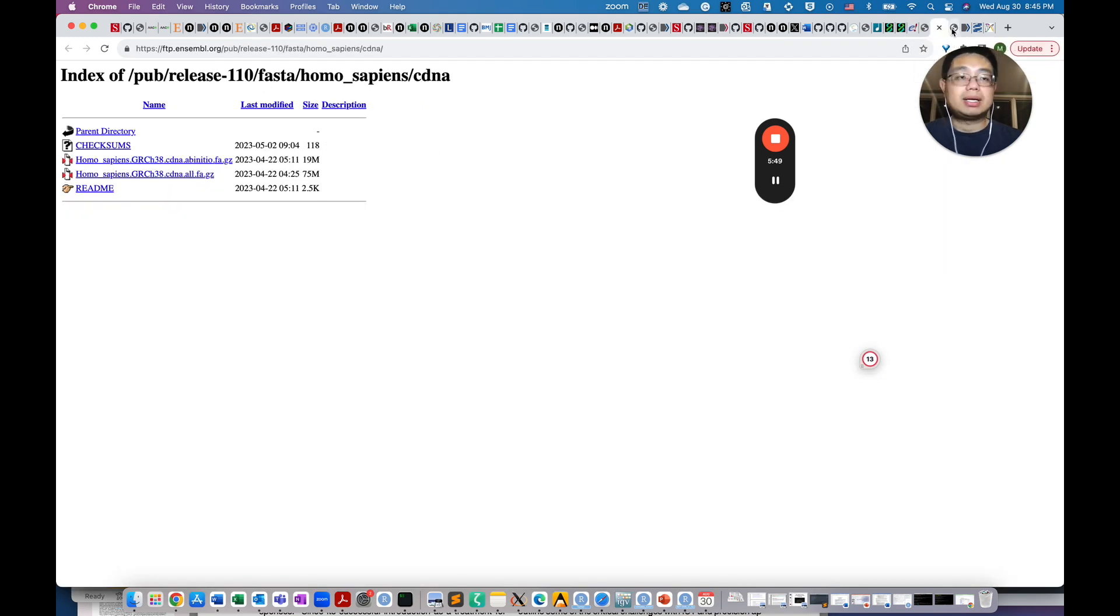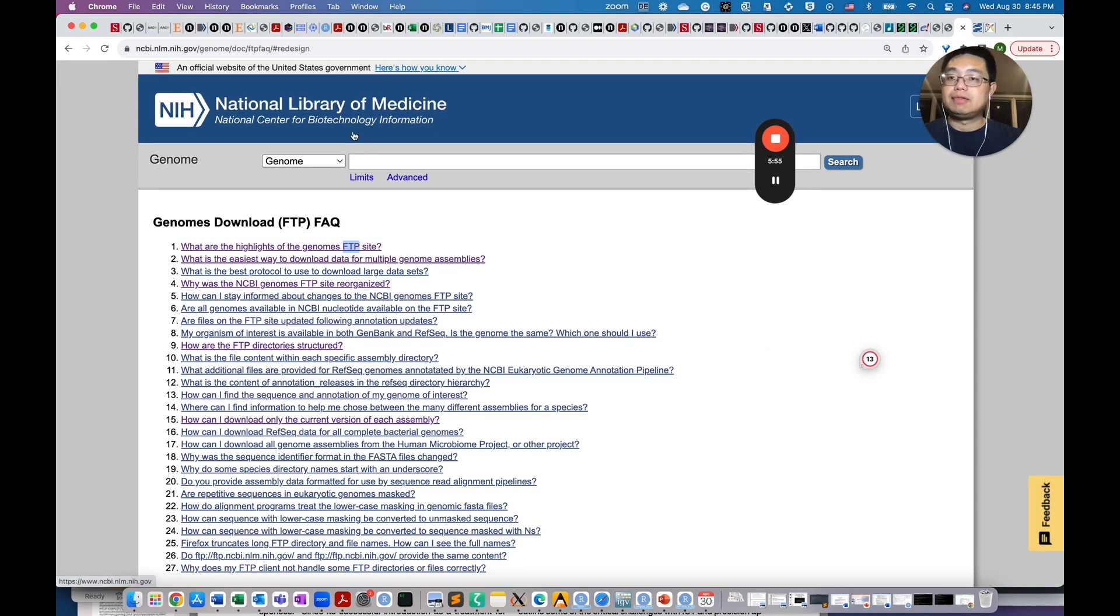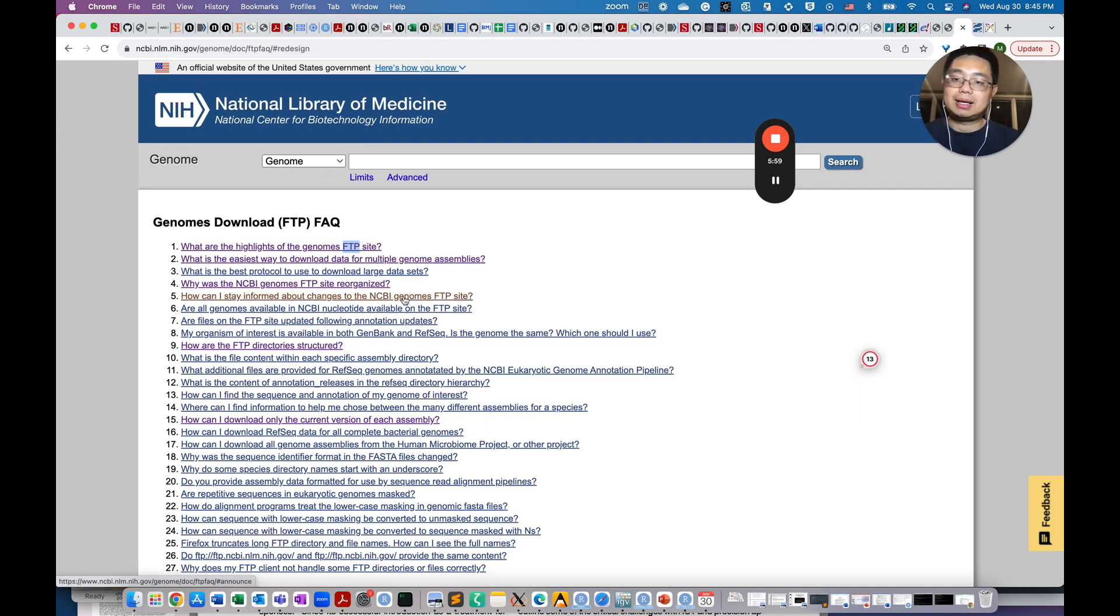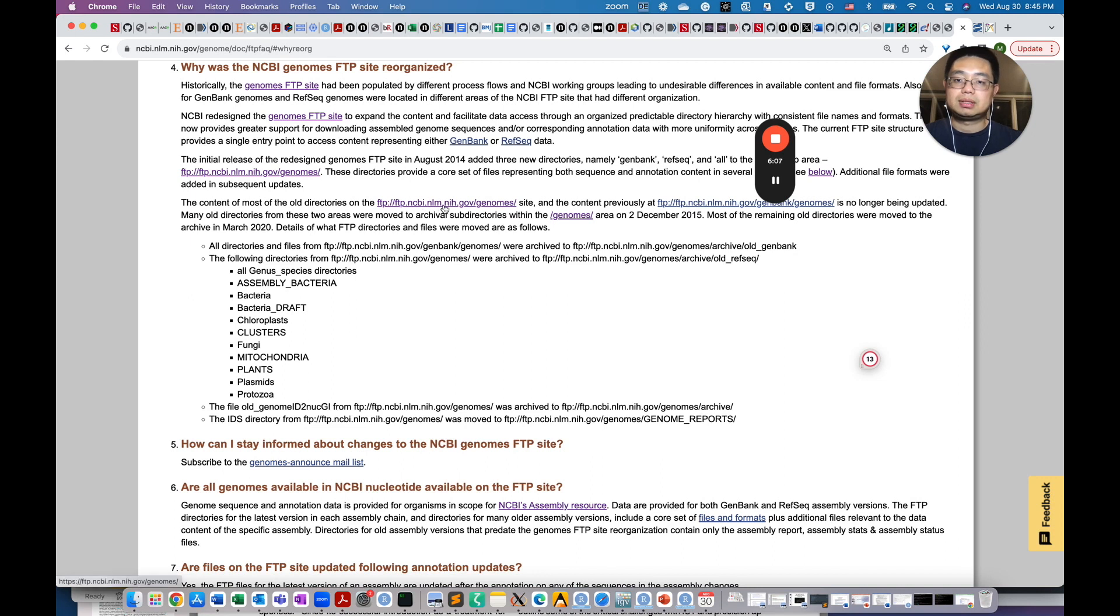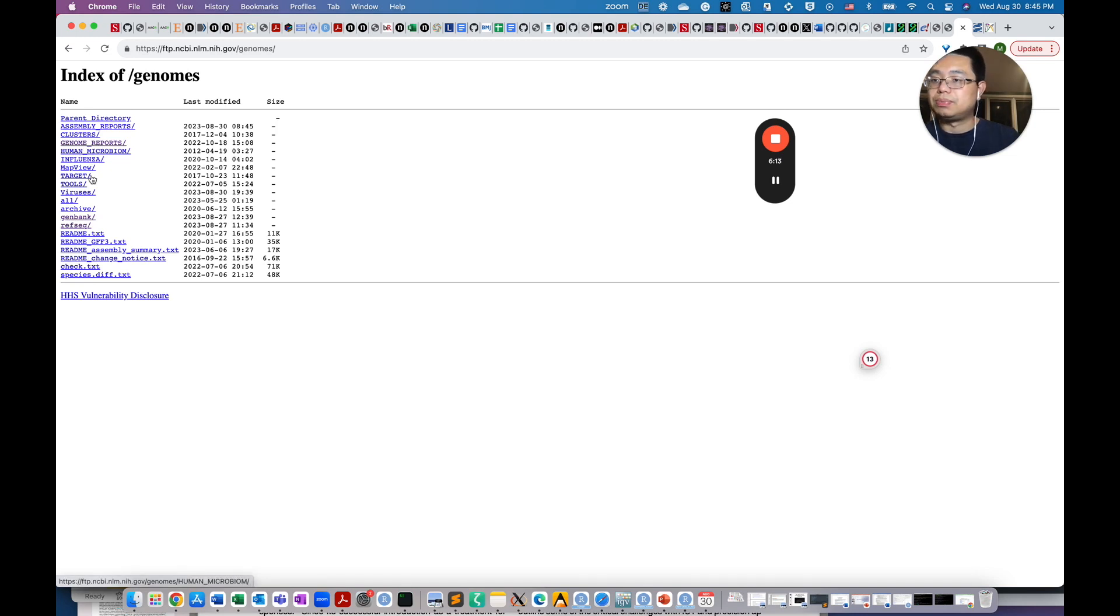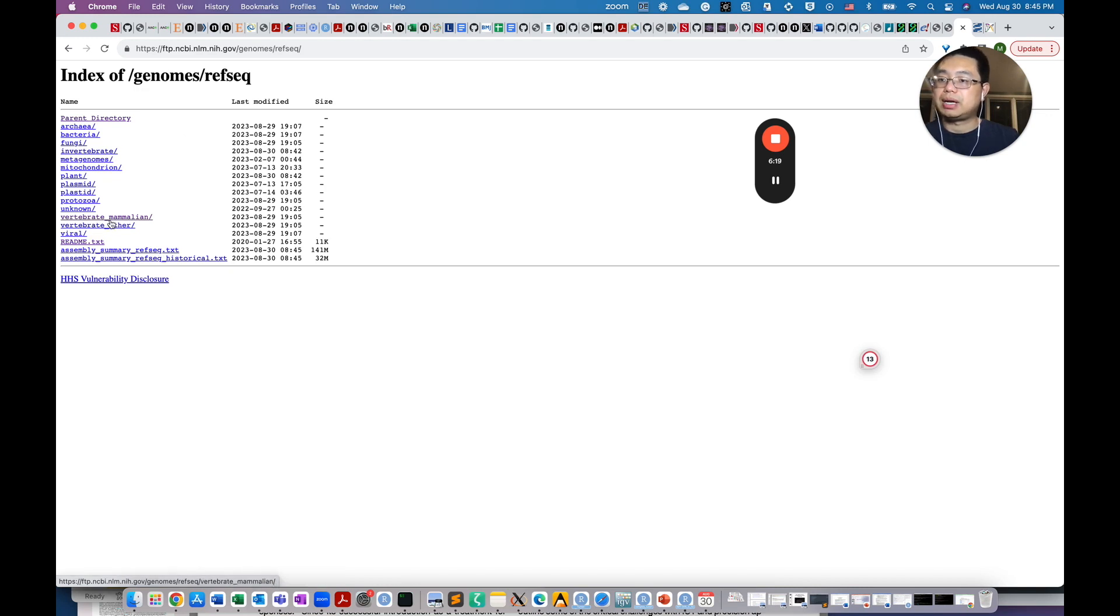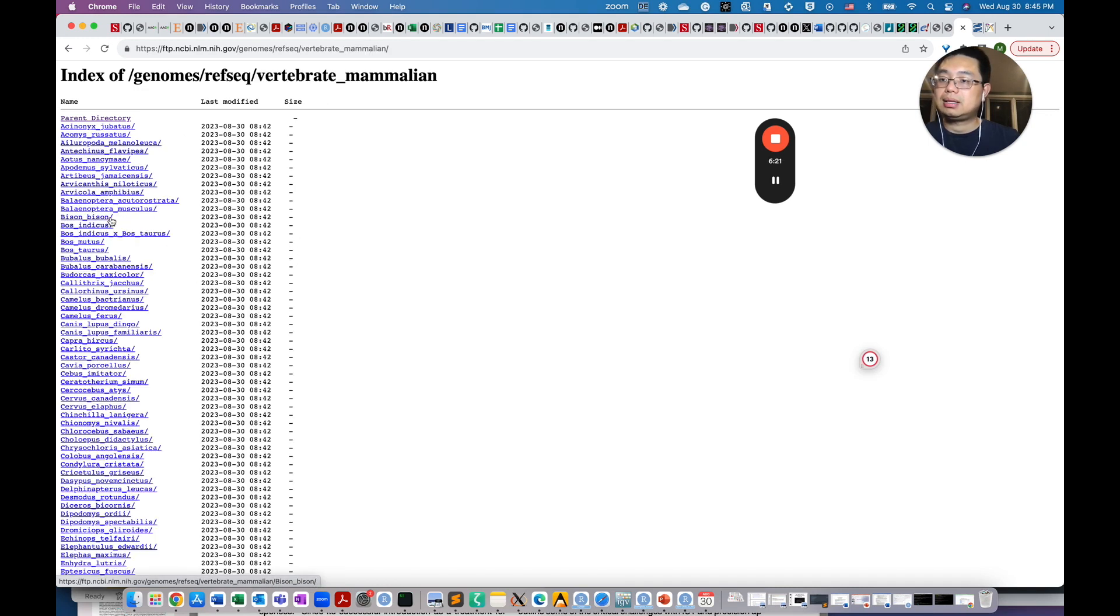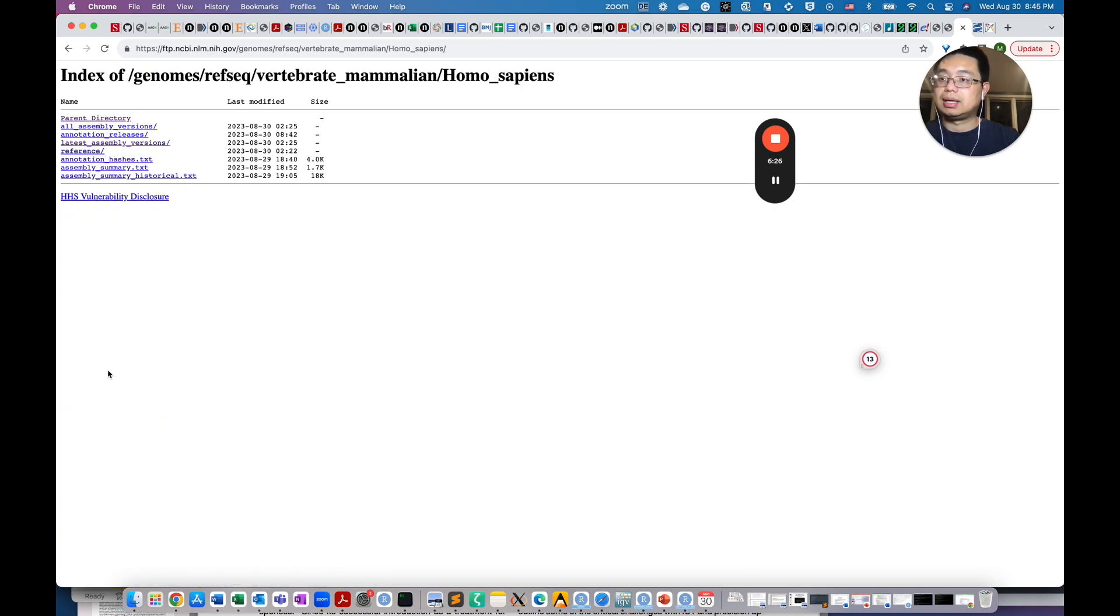The next place that you can get those files is the NCBI. If you Google NCBI download reference genome files, you will most likely land on this page. And this FTP site, you can see here, click it. And then you see the genome, then you can go to the RefSeq. And you can go to Vertebrate Mammalian. And then you can go to Homo sapiens, the human.